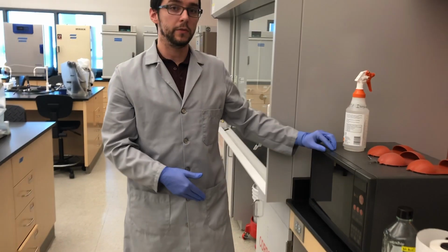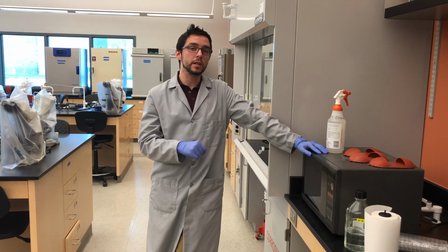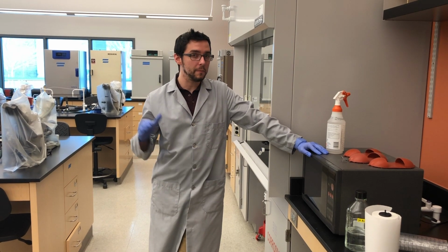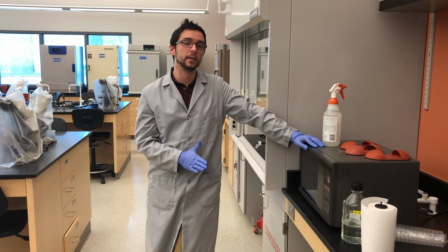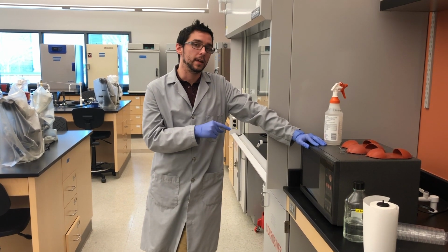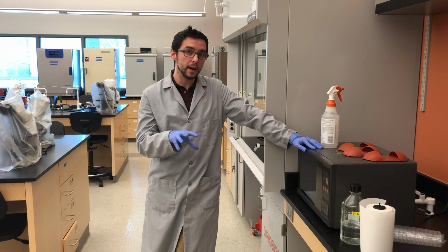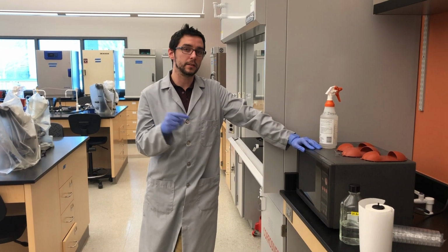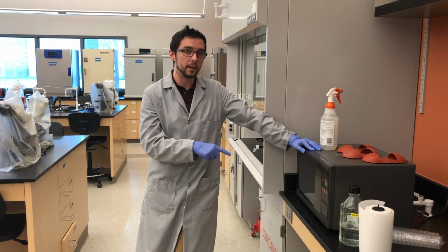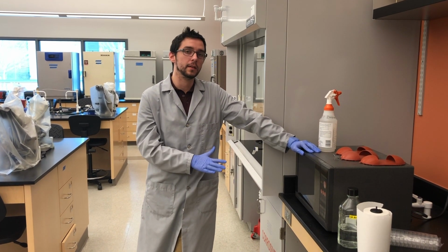So why are we microwaving the Ziehl-Neelsen? That mycolic acid, as I mentioned, is extremely hydrophobic. Not many molecules are allowed past the mycolic acid for that reason. The heat is acting on the mycolic acid to loosen it up just enough that this Ziehl-Neelsen dye can get through the mycolic acid and into beneath the cell wall.